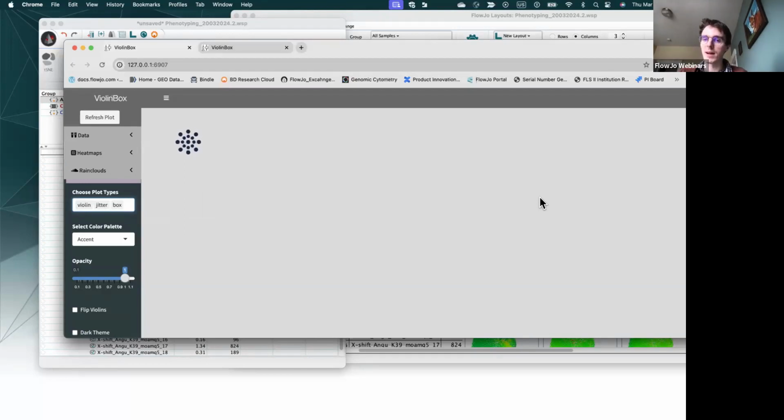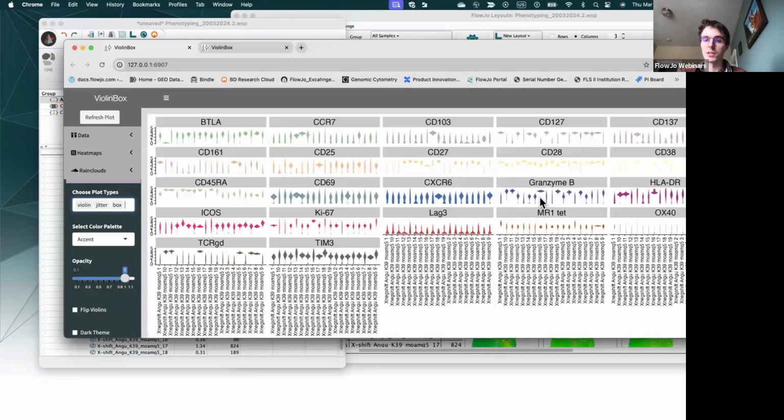Somebody is asking about the median values if you copy and paste from Cluster Explorer. I think they're a bit off in the newest version of FlowJo, and we haven't released a new version yet that's going to fix that. You can use the same normalization for the Cluster Explorer heat maps. I'd have to double check, but I'm pretty sure they're using the same scale as the parameters in FlowJo.